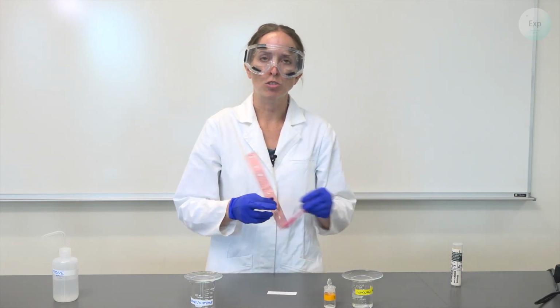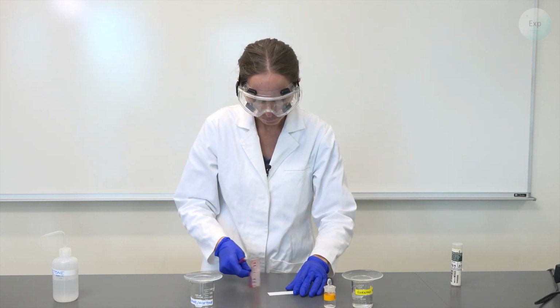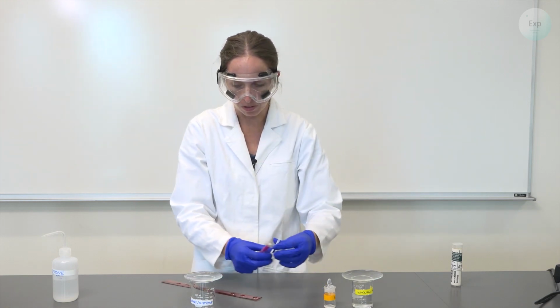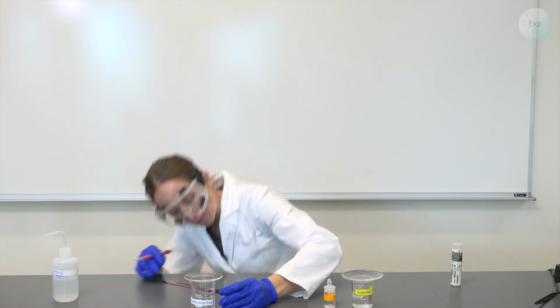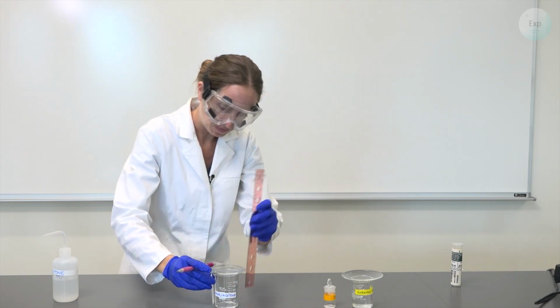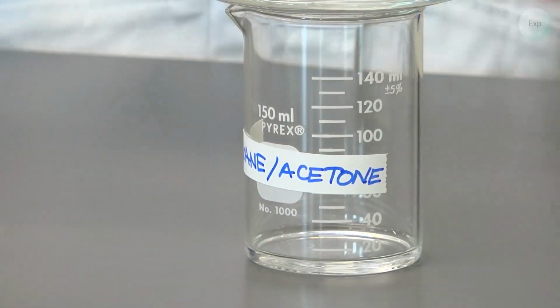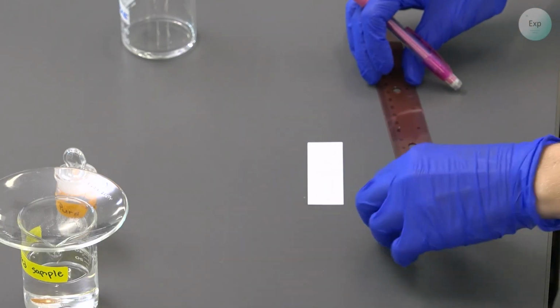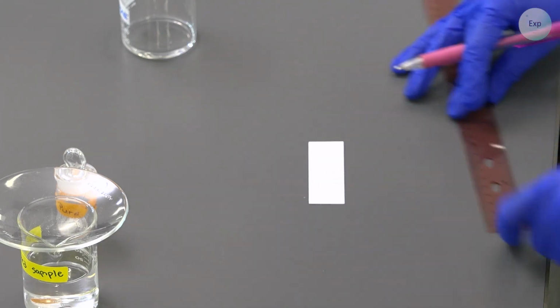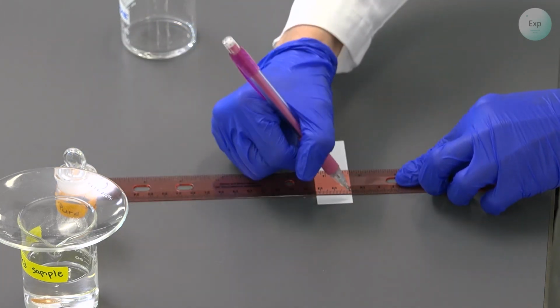I'm going to use a ruler to draw a straight line with pencil. When marking a TLC plate, you must only use pencil. I'm going to pick a height which will be above where the solvent level is. Just estimate that. To be sure, if you want to use a ruler to measure that, you can. My sample height appears to be about 5 millimeters, so I will measure up about 6 or 7 millimeters. Now I will draw a line across the TLC plate.